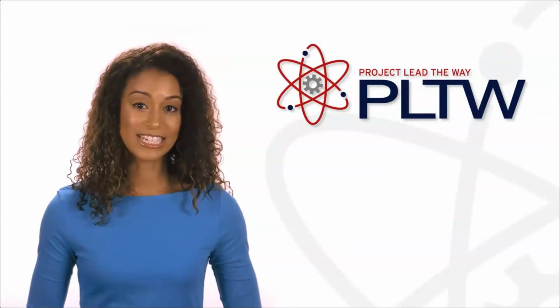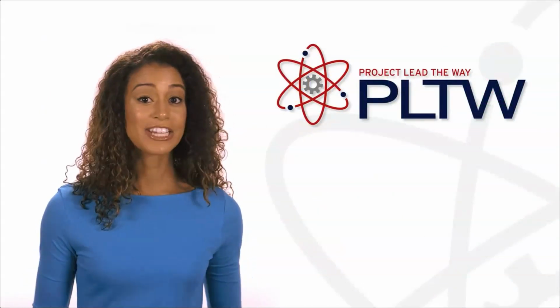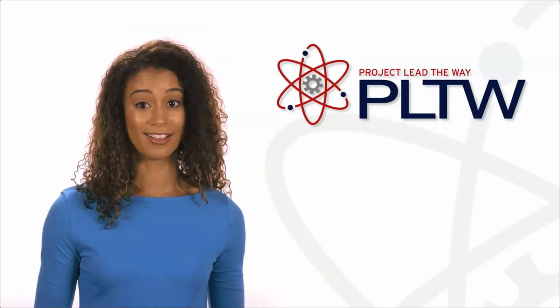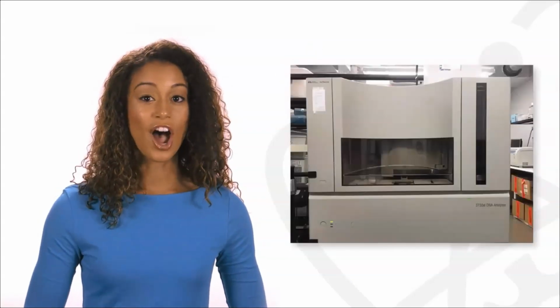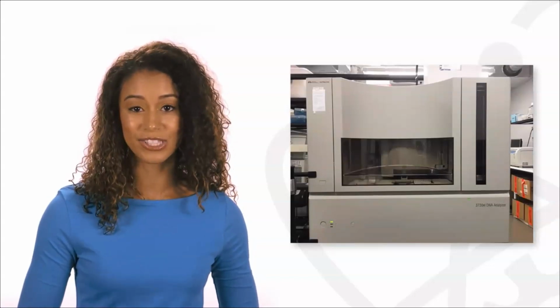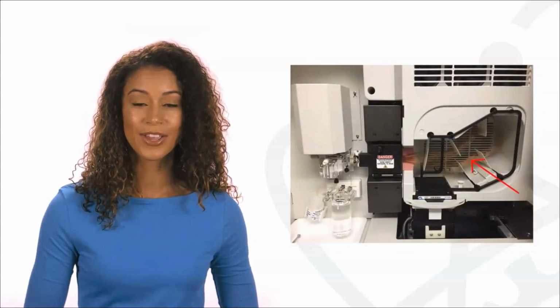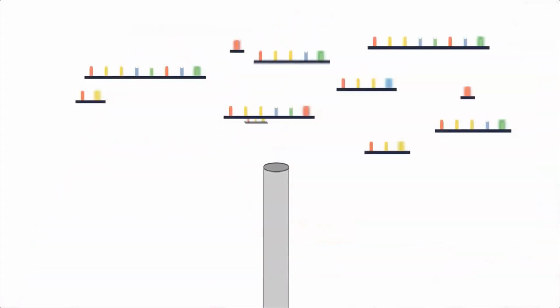Now that you have all of the DNA fragments, you need to separate these fragments by size. Imagine how time-consuming it would be to separate these sequences by a traditional gel. Luckily, that's where our automatic sequencer comes in. The automatic sequencer performs gel electrophoresis to separate the DNA by size and then analyzes the results. Notice the thin capillary tubes inside the sequencer. The tubes are filled with a buffer solution, and the fluorescently tagged DNA pieces are inserted into these tubes.